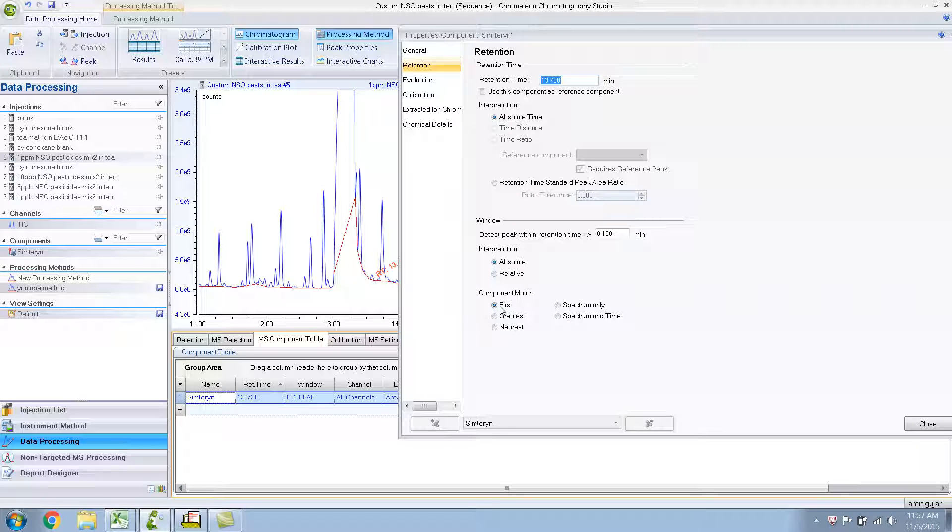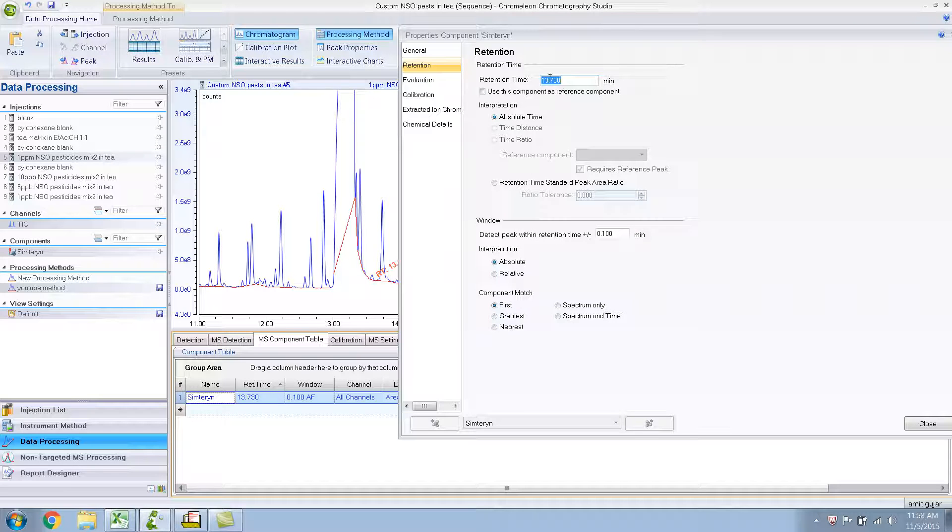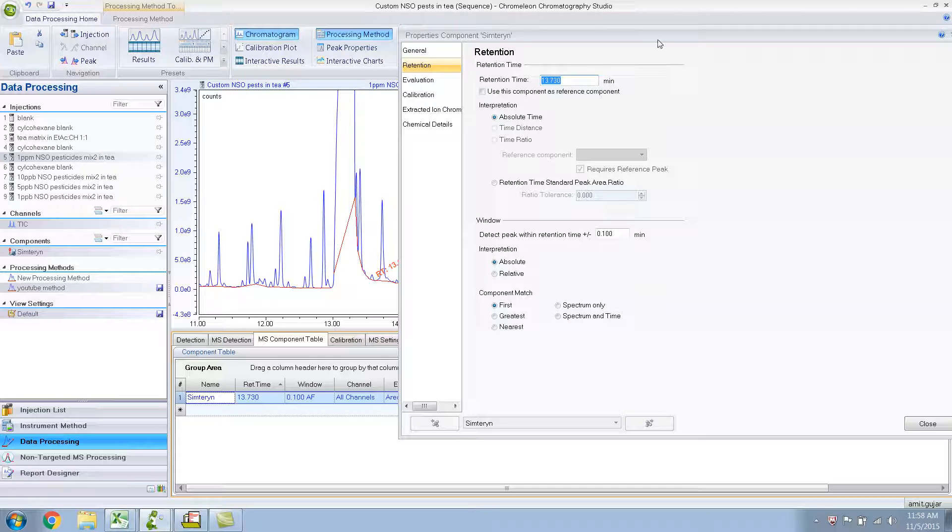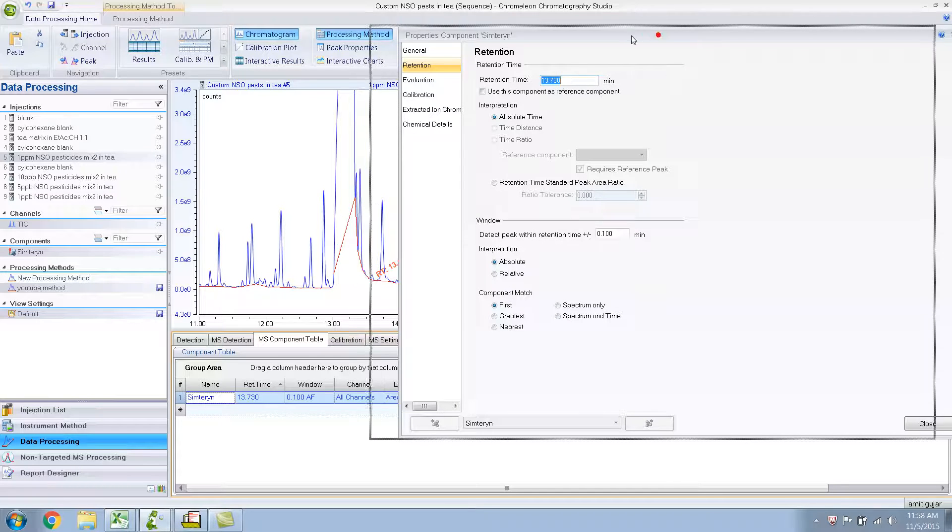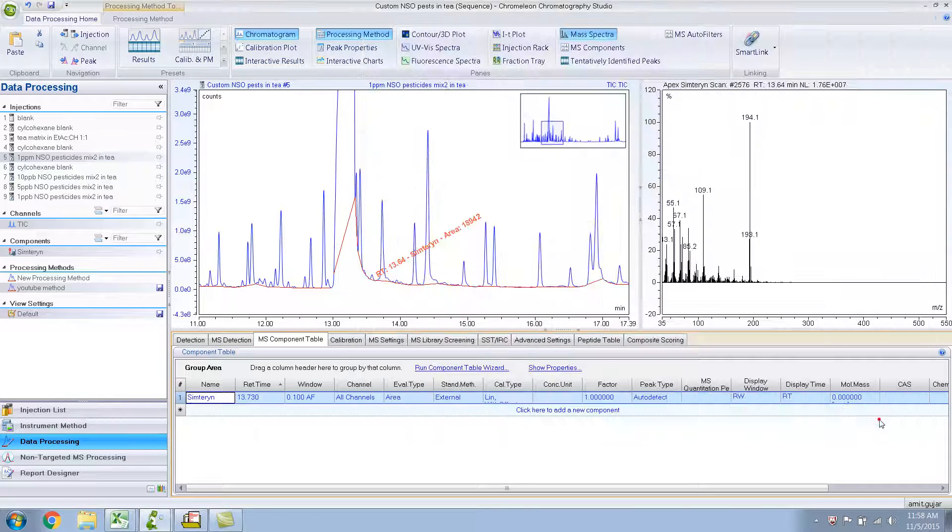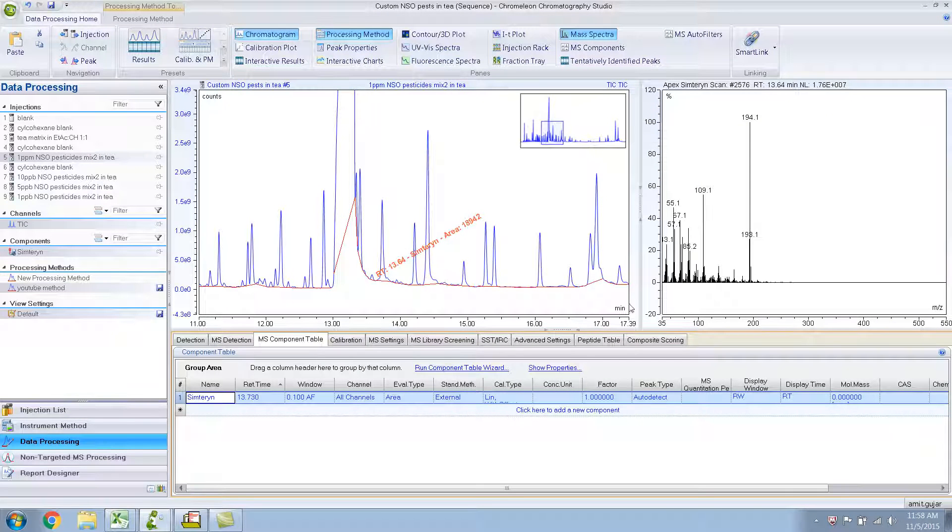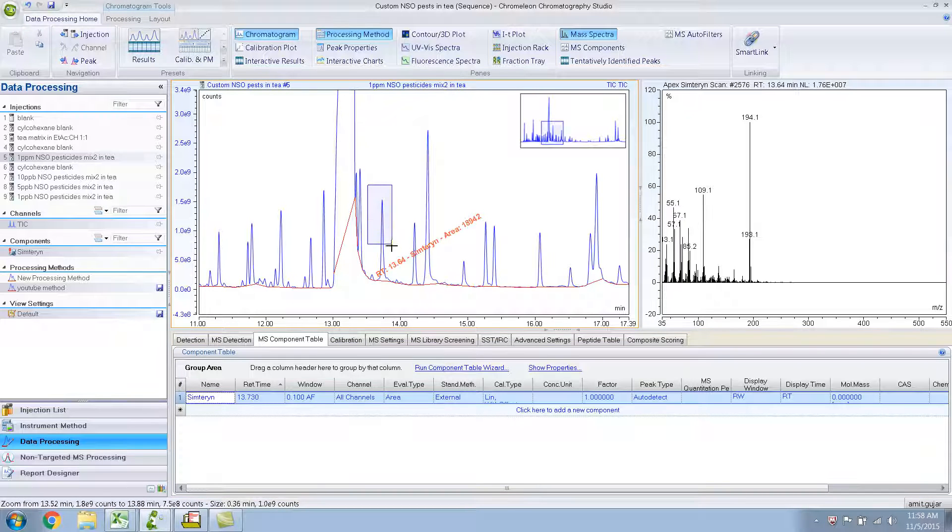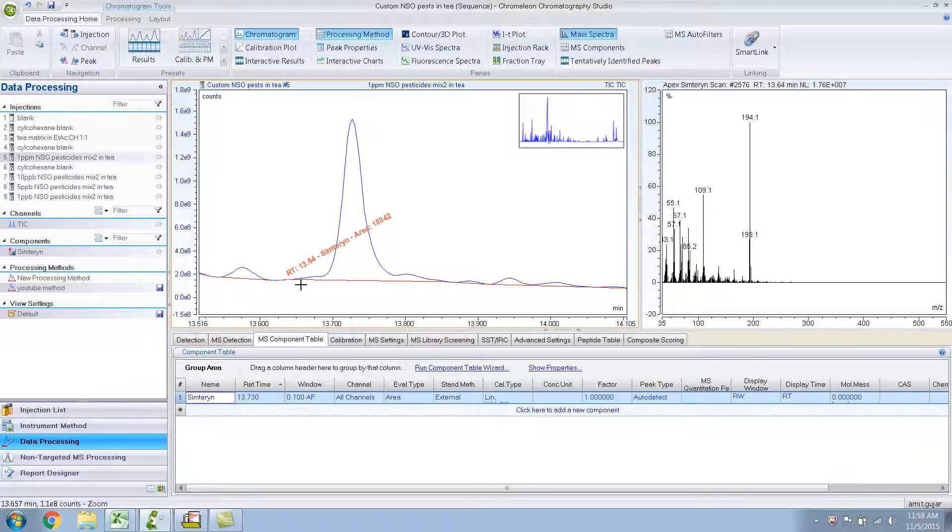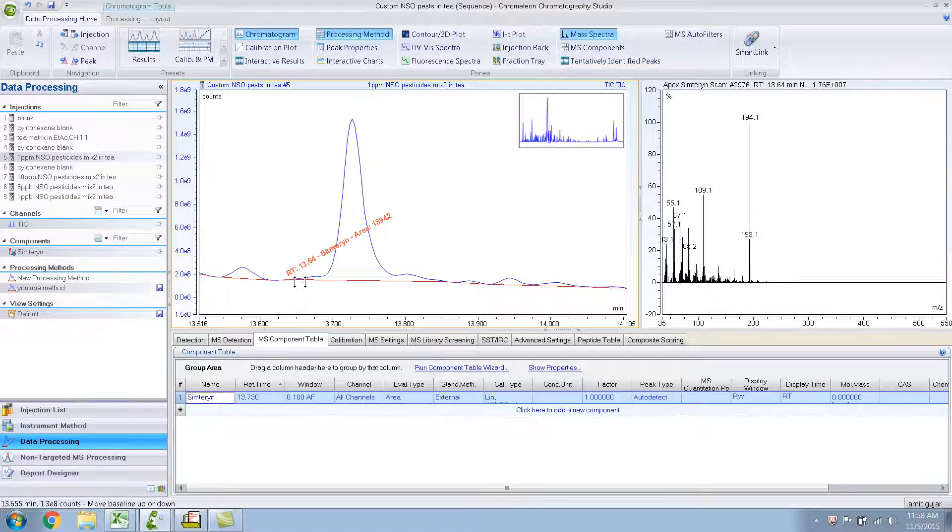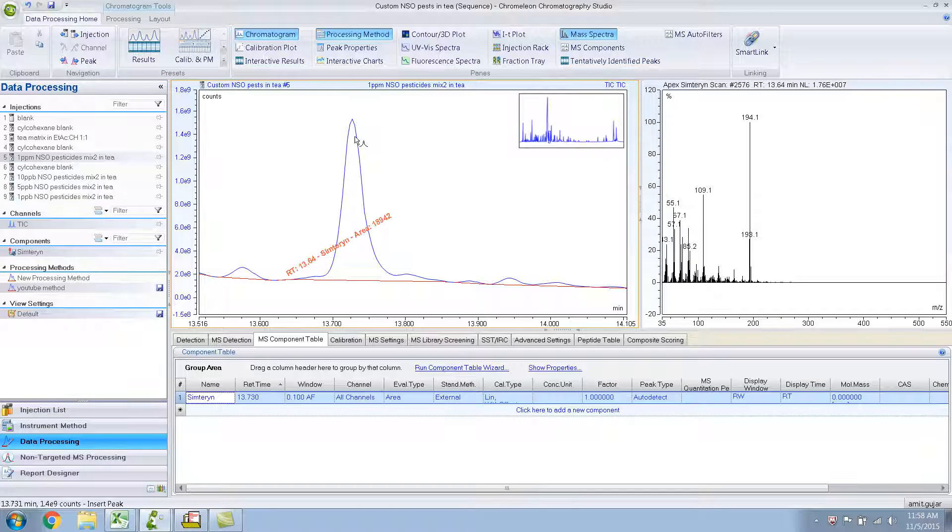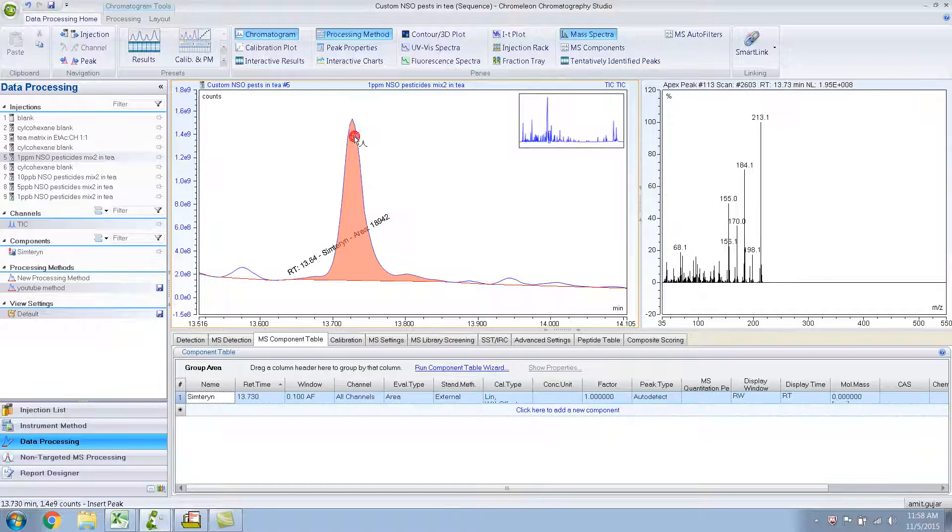Whichever peak that is the first from 13.73, that it will label. You see, if I do it at first, what it has done, it has labeled the peak which was the nearest to 13.73 plus or minus 0.1, right? It labeled the peak over here which it thought at 13.64, which is obviously not right. We want this peak, we want this peak, right?